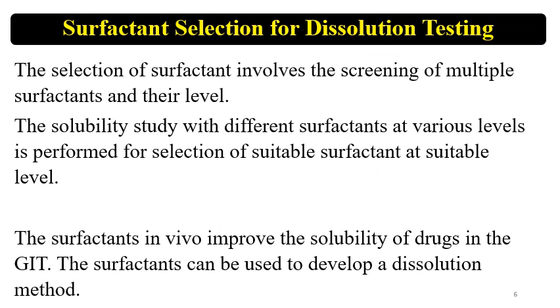Now we will see how the surfactants are selected. When you are going to perform dissolution of low soluble molecules or formulations containing low soluble drug substances, surfactants are needed, and selection of the surfactant and its level is very critical for dissolution testing.